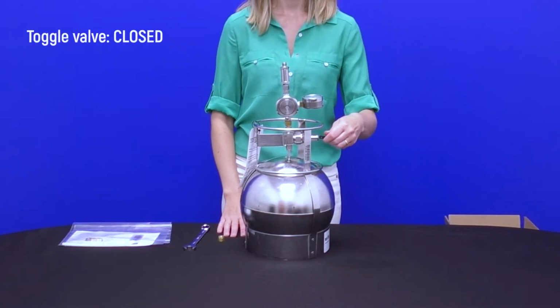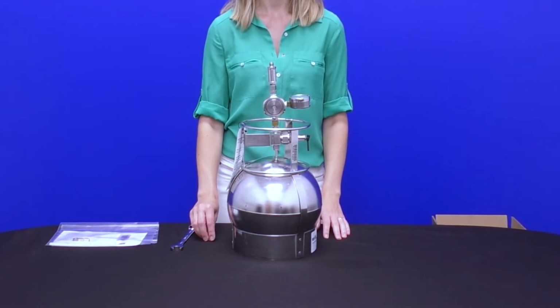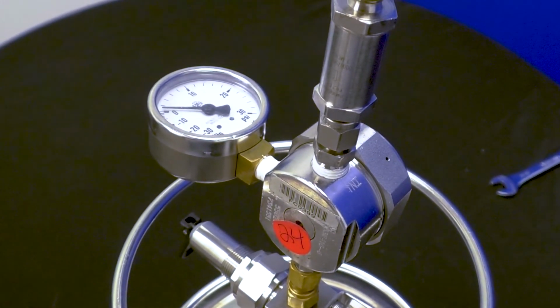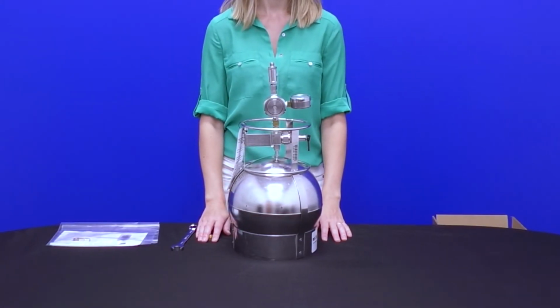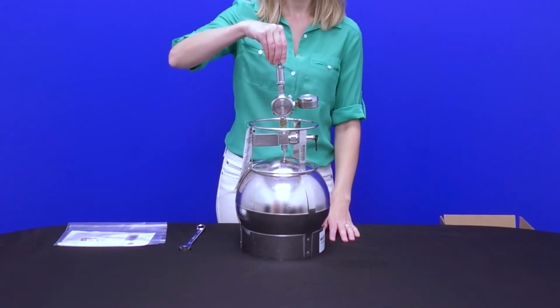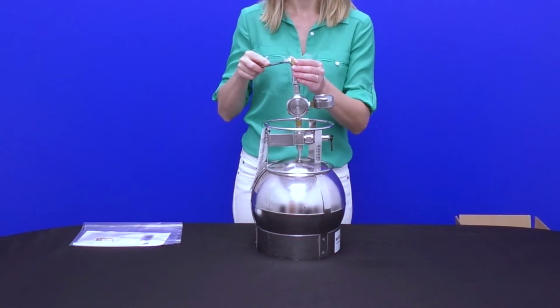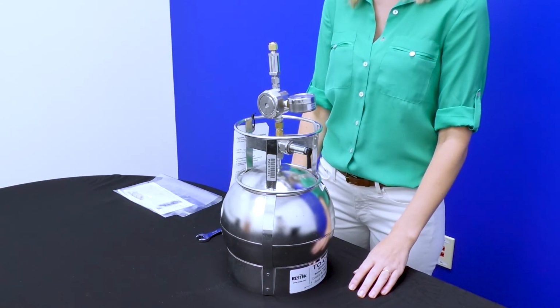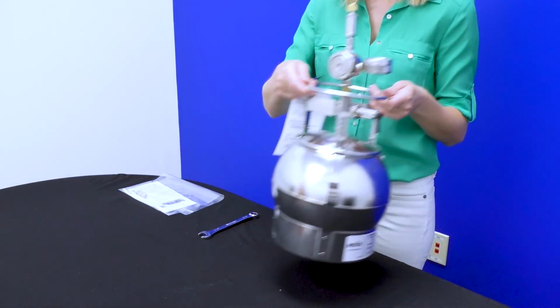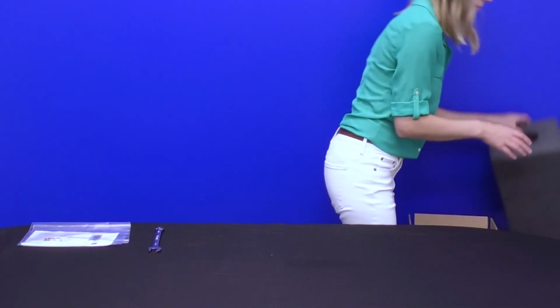When sampling is complete, close the canister valve and record the final pressure on the COC and canister tag. Make sure that you leave just a little remaining vacuum in the canister. This allows the lab to confirm whether the valve was opened or a leak occurred during return transport. Reattach the brass cap to the top of the sampling assembly. Repack the canister using the protective foam insert. Complete the shipping and COC documents and return the samples to the laboratory.